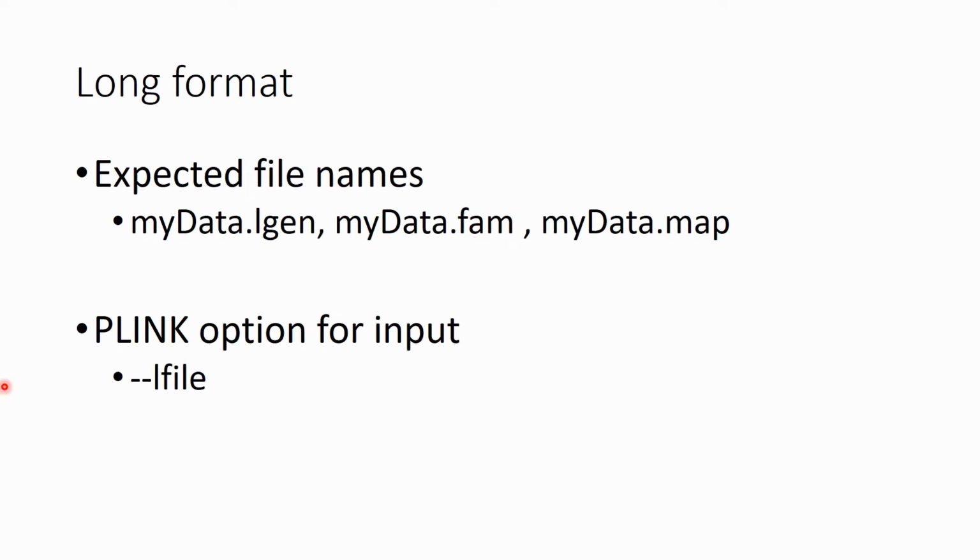The next format that you could encounter also in the videos on the Genomics Bootcamp is the so-called long format. For this data input, we require 3 files with the specific extensions: .lgen, .fam, and .map.